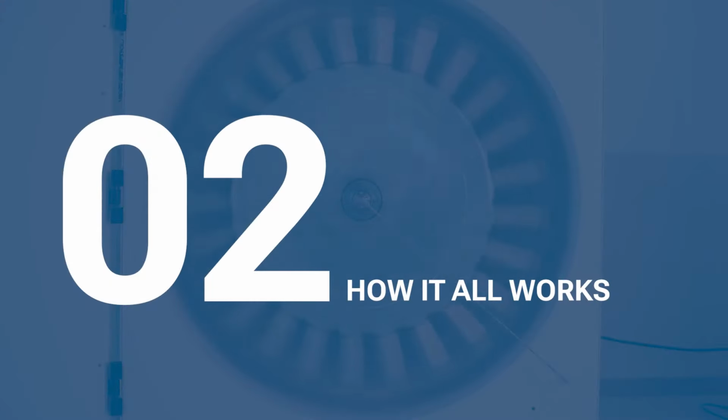The 3 compounds have different partition coefficients and will distribute differently between the upper and lower phases based on their partition coefficients. The compound with the lowest partition coefficient relative to the descending mode will separate in the descending mode. Then, when you switch modes, the compound with the lowest partition coefficient relative to the ascending mode will separate in the ascending mode.